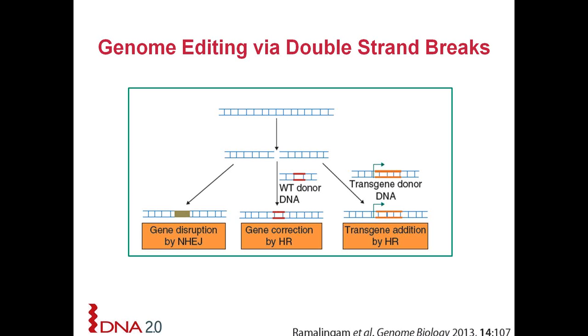Great. A more practical question, how do you sort the cells in which the indel happened out from the wild type cells?